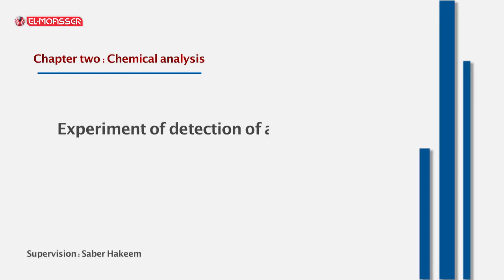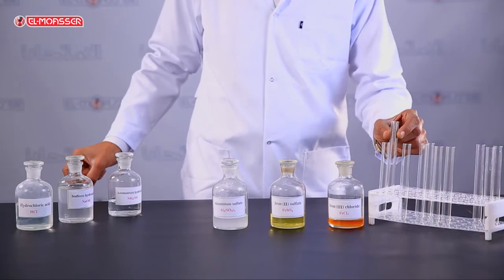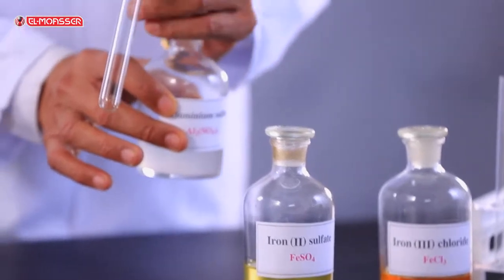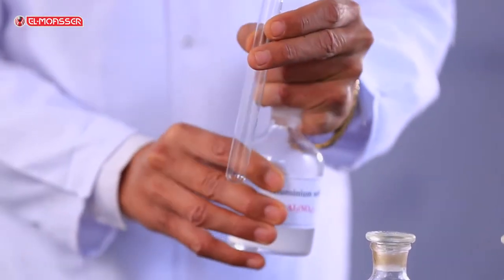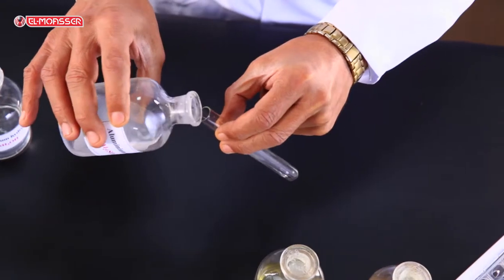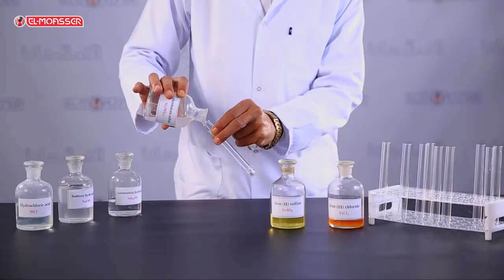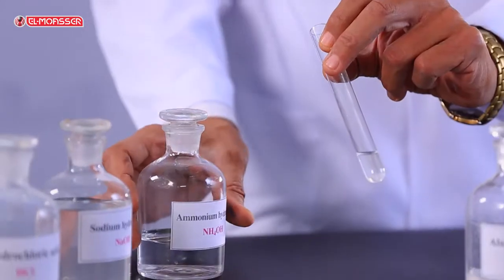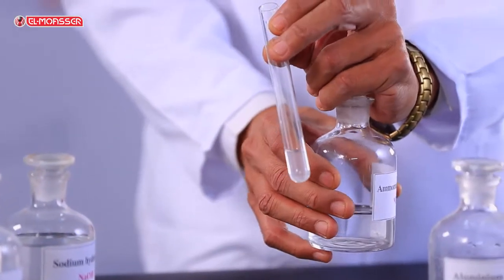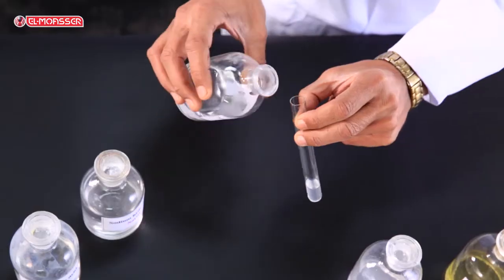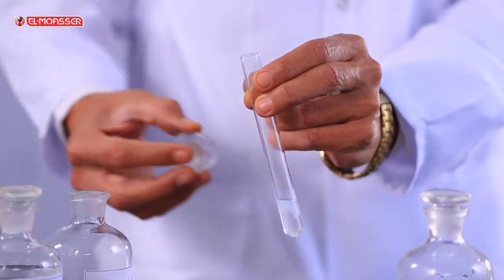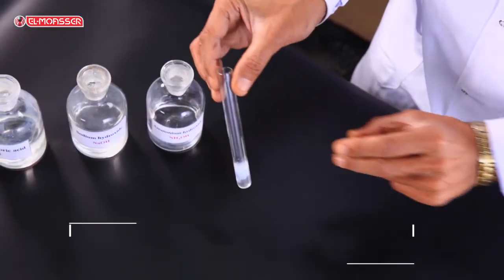The detection of aluminum cation is performed using aluminum sulfate solution. In the main experiment, add a small amount of ammonium hydroxide solution to aluminum sulfate solution. A white gelatinous precipitate of aluminum hydroxide is formed.